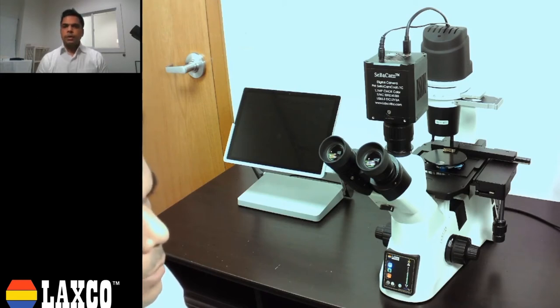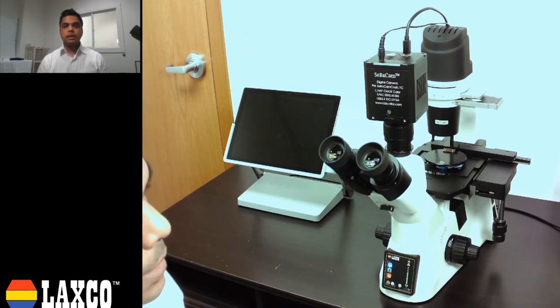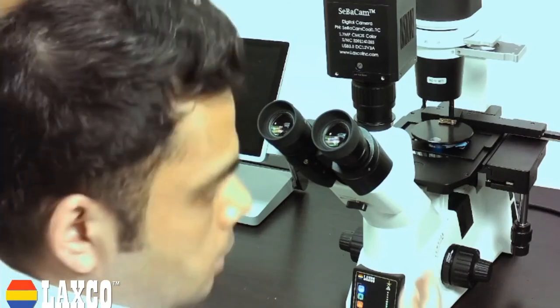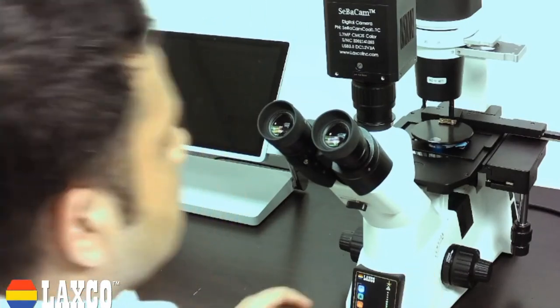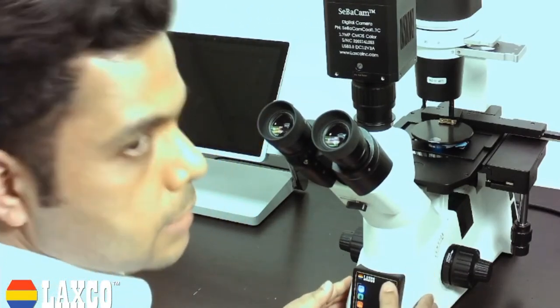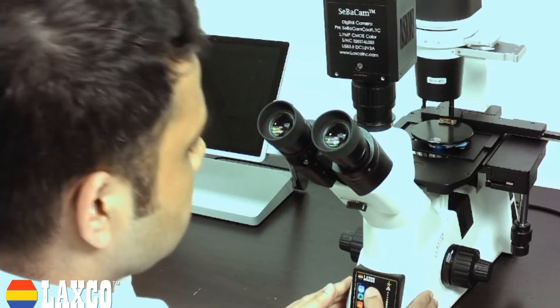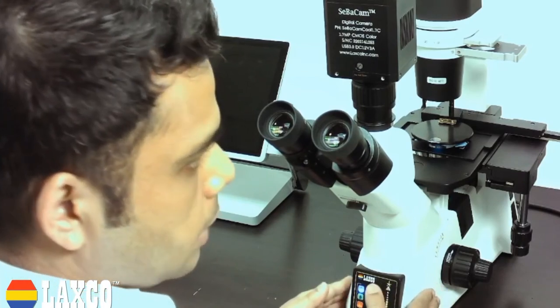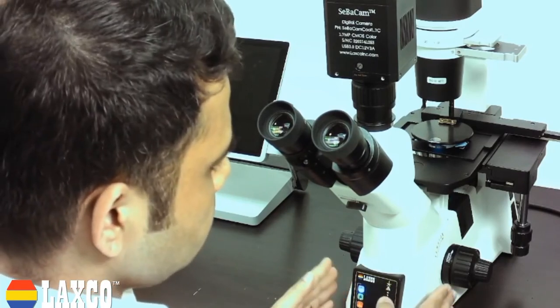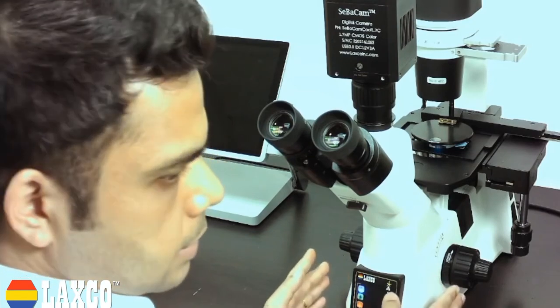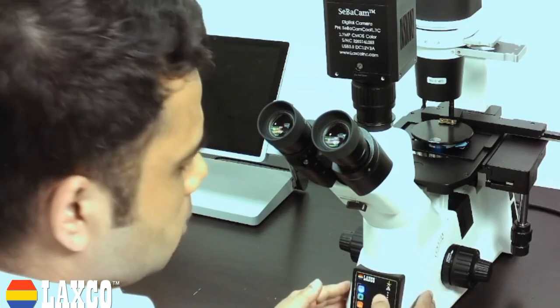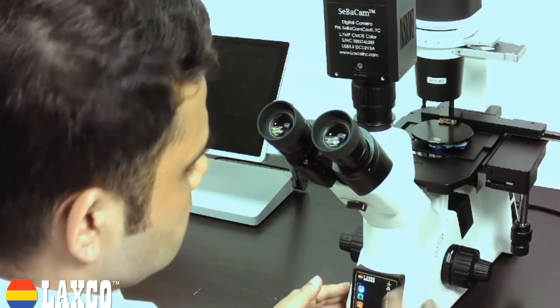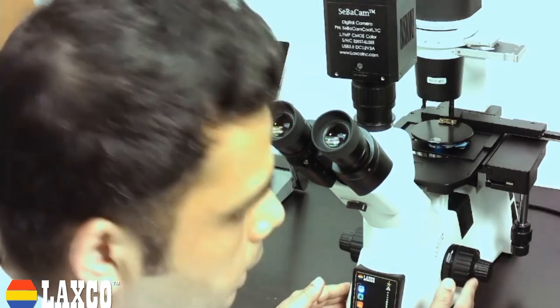Before you take a look at some of these amazing fluorescent images, let me show you our microscope. If you look here, we have our SLI3 Pro inverted fluorescent microscope. This is a fully multi-channel system. Like any other inverted microscope, this comes with all the standard features.